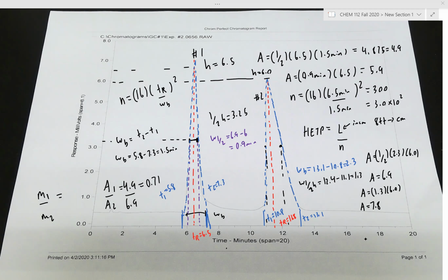So it's really important that you understand and are comfortable analyzing chromatograms and calculating area percent, mass percent, and all of these other quantities, as you'll be doing these types of calculations not only for these gas chromatography labs, but also for the subsequent experiment 3D, which focuses on fractional distillation using a spinning band column.